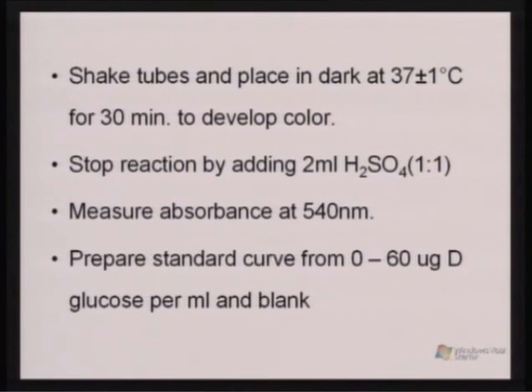to stop the reaction by adding 2 ml sulfuric acid 1:1, and then measure absorbance at 540 nanometer using a spectrophotometer, and prepare a standard curve from 0 to 60 microgram D-glucose per ml and a blank.